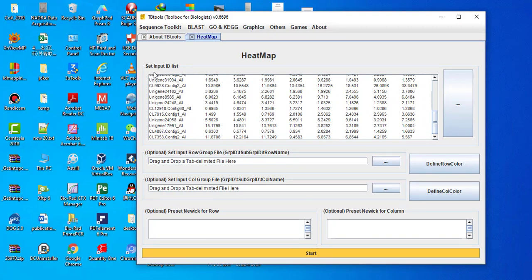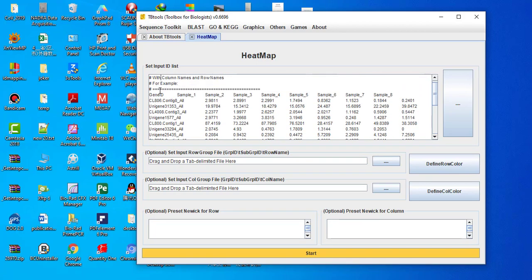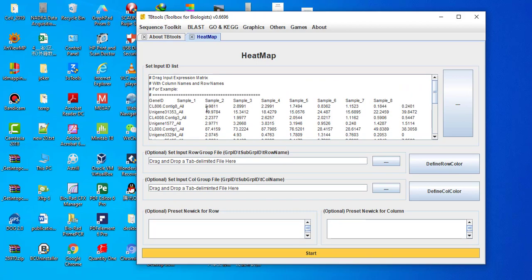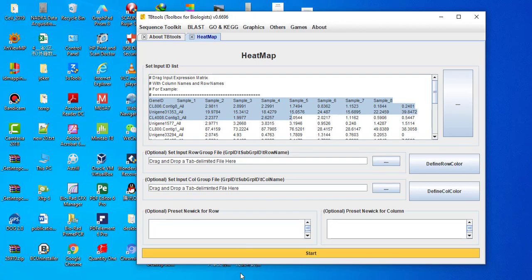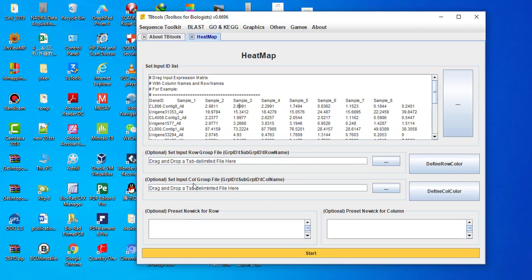First, set the input list — here you can put your genes with your samples and their values. Remember, you need to put this file in tab-delimited format, which you can make using MS Excel. Next, you can group your samples using column or row. The next two tabs are for grouping in row and grouping in column.